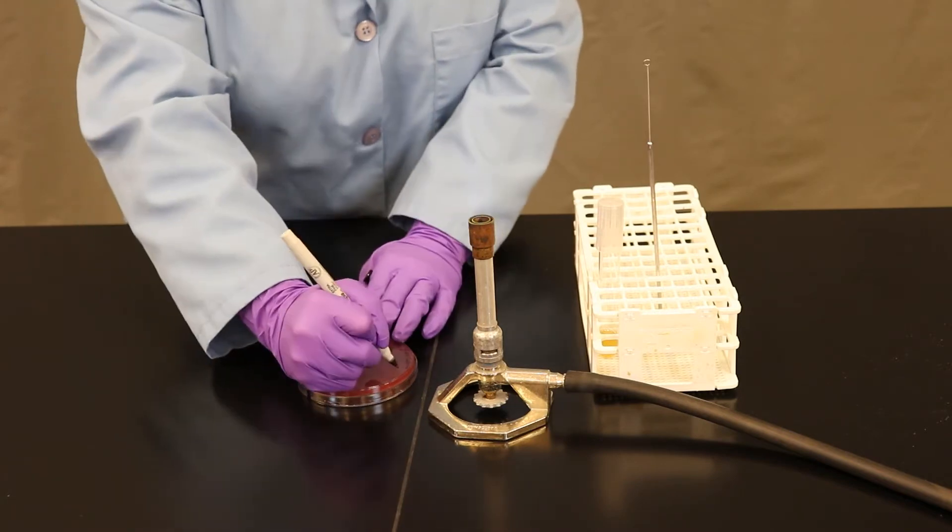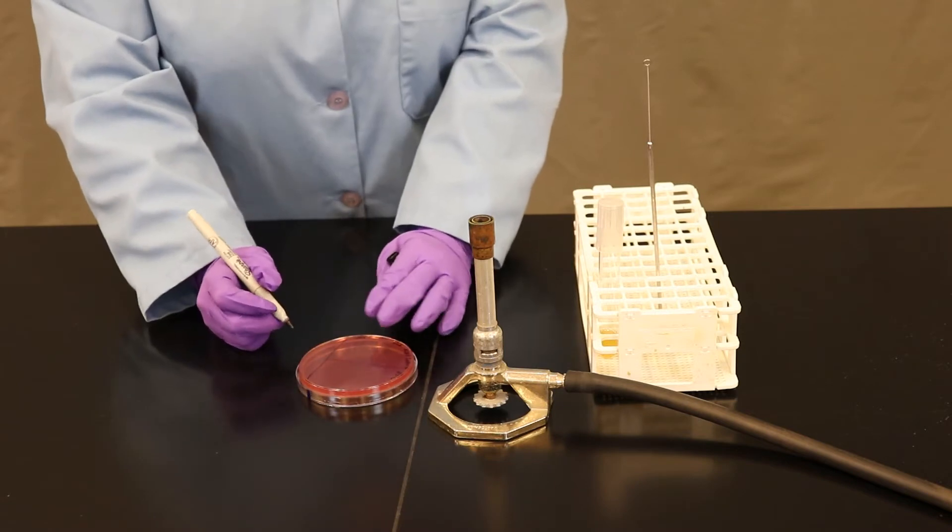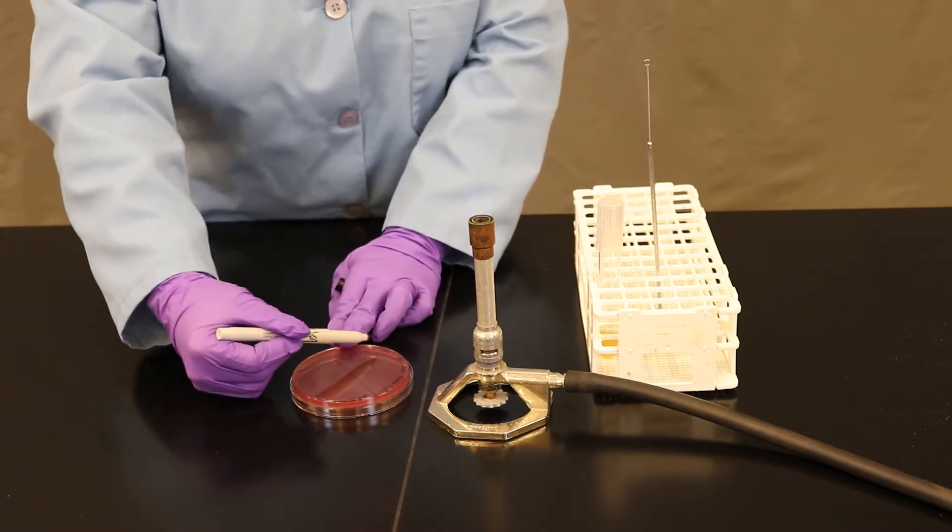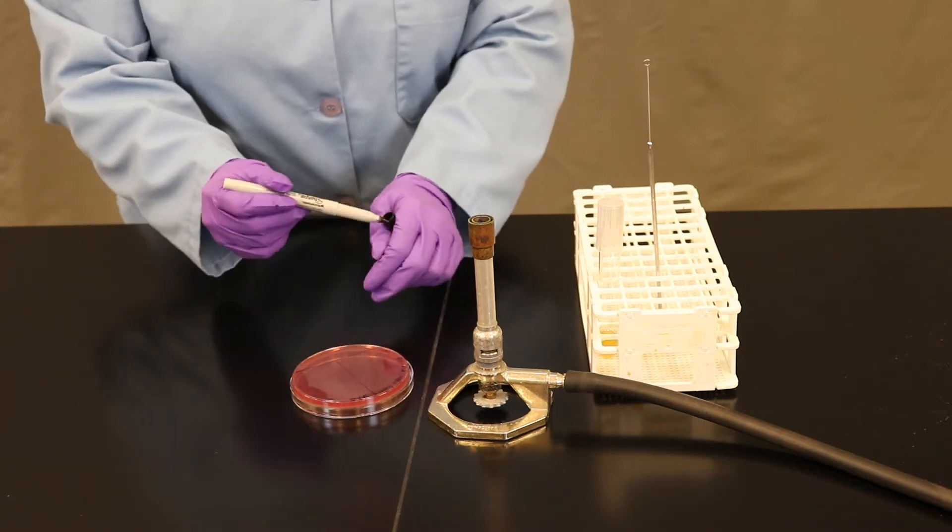And in some cases you can indicate the temperature you're going to incubate at. For us, we're going to use 37 degrees Celsius. Notice that I'm going to label my plate around the edge, as to not obstruct my view in the center of the petri plate.